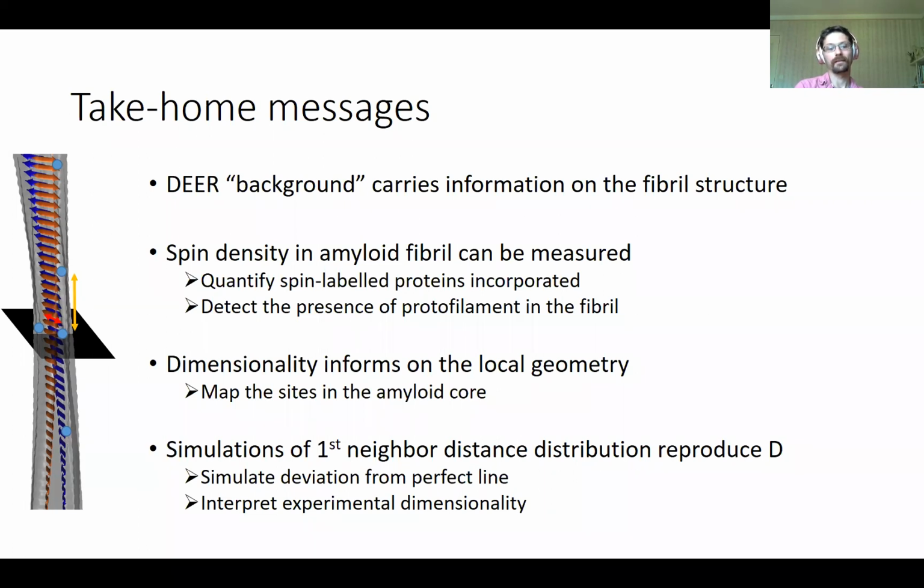And it makes sense, because as you get your spins closer and closer, especially because these are very tight assemblies, you would expect that you're losing your T2. And if you go to low dilution, so a lot of spins in your fibers, you almost get no signal anymore. So we use that as a way to say, yes, we are actually measuring spin densities, but not more than that. Okay, thank you.